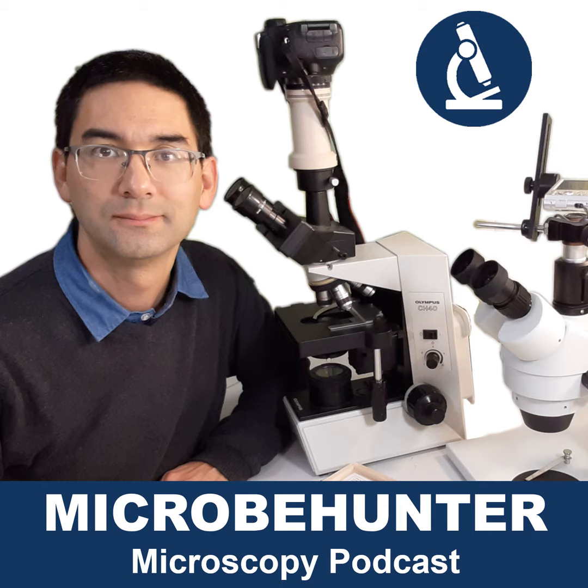But the easiest and simplest way to increase magnification would simply be to exchange the eyepiece, okay? If you exchange a 10 times eyepiece for a 20 times eyepiece, of course you're doubling the magnification. So with a 40 times objective and a 20 times eyepiece, you get a total magnification of 800 times. This might be useful in certain circumstances, but you have to be aware that this way you lose quite a bit of resolution as well, because it's the objective that determines the resolution and the clarity and the sharpness of the image.